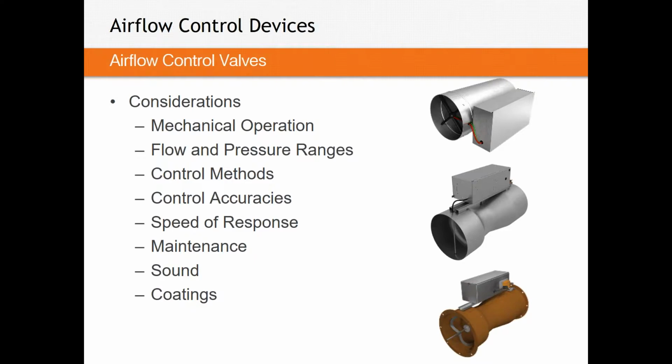Then we're going to move into probably the largest part of the talk, and that is speed of response. In a laboratory, we know we need a high speed of response. We need fast-acting valves. We need containment at all times. But what does the phrase speed of response mean?